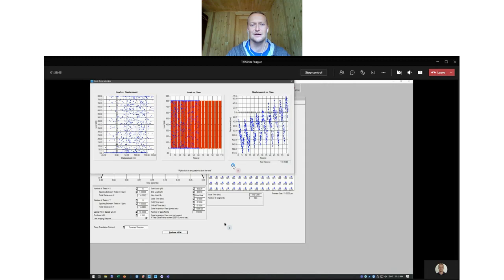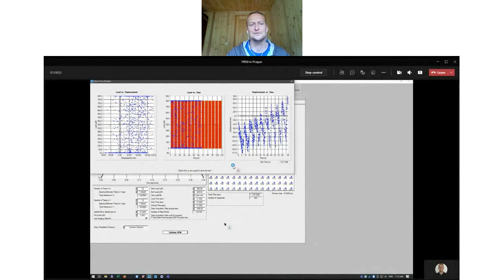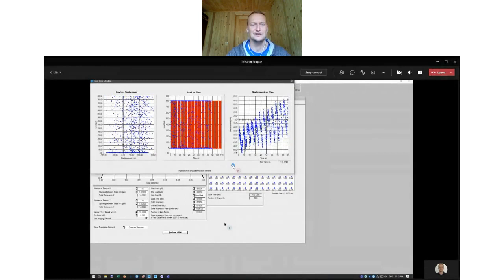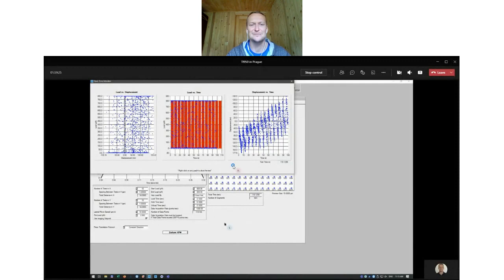So it's a synchronized signal between the piezo and our electrostatic transducer. So we can have a correlation between the SPM scan, so between the topography scan and the mechanical data. So you can directly correlate the mechanical properties with the different phases that you have in your heterogeneous material. So this technique has been widely applied now for any sample because it's very fast. So those of you who have some experience with indentation, you know that just 100 indents takes more than an hour. And now we did 225 indents in less than 2 minutes, and the test is done.